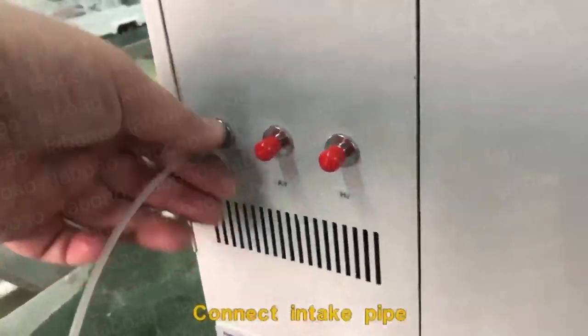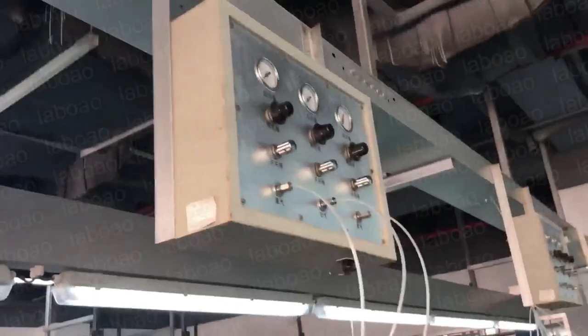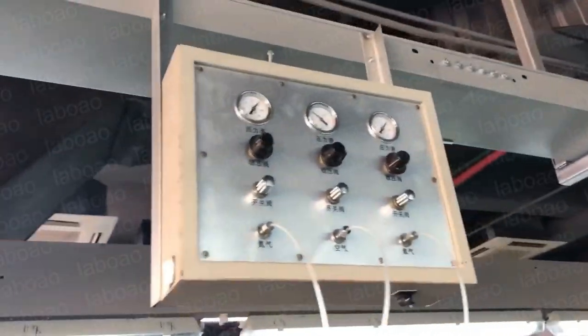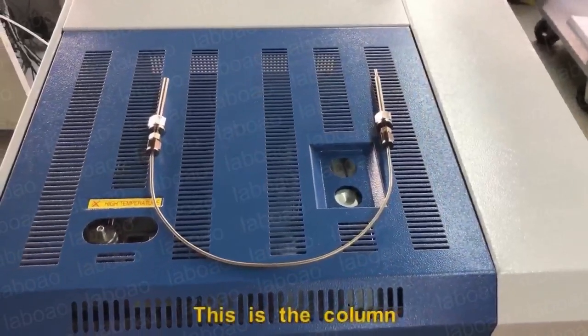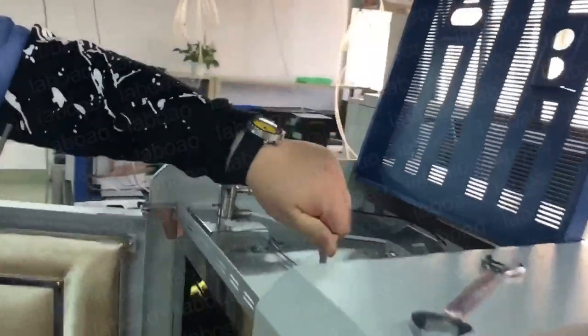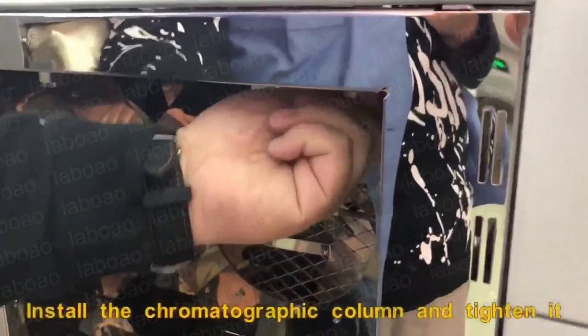Connect the intake pipe. Rotate to open the air valve. This is the column. Loosen the corresponding knots, install the chromatographic column, and tighten it.